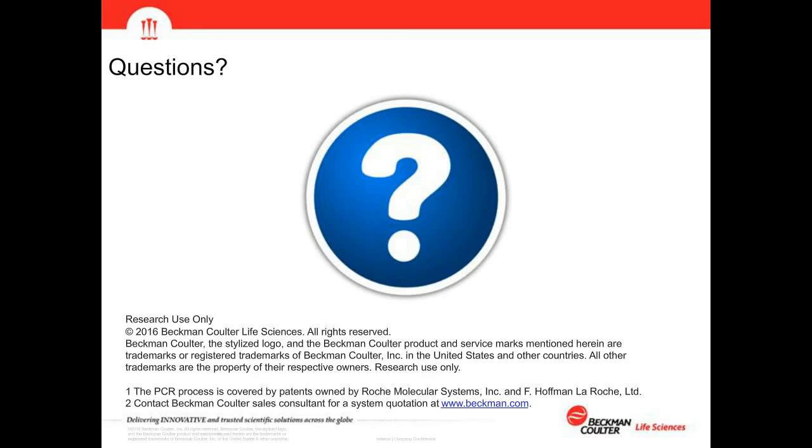Thank you. How long does it take to implement an existing method with no modifications versus one with modifications? Yeah, I can take that. Typically what we found when we install a method is that usually there will have to be some sort of modification made to it when it's deployed. We will have a customer want to change which PCR plate is being used, for example, or they'll have some other requirement. Say, for example, in the case of labs that are working in a clinical environment, they don't want to reuse tips. So we will have to provide a reconfiguration for that.